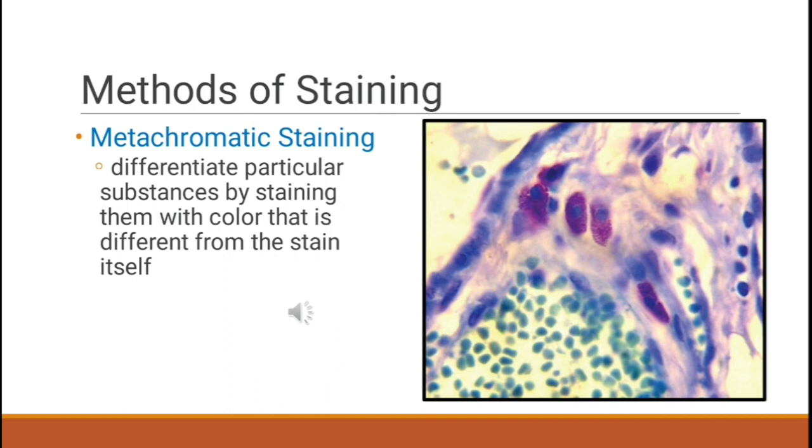Toluidine blue is a basic thiazine metachromatic dye with high affinity for acidic tissue components, thereby staining tissues rich in DNA and RNA. The use of toluidine blue in tissue sections is done with the aim to highlight components such as mast cells, granules, mucins, and cartilage.